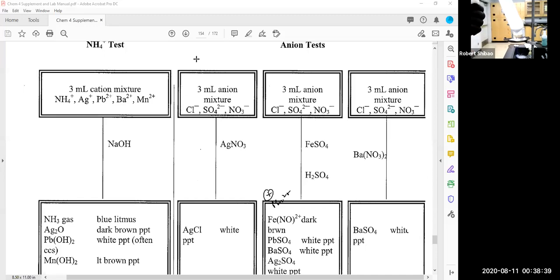What's happening here is you can see the precipitate's coagulating on the bottom. It's coagulating, so it's growing into bigger crystals, and those crystals are sinking to the bottom. I don't want to stir this because I want it to settle to make sure I precipitated out all the silver. Remember, if silver sneaks through, then that leads to interference. And so I'm going to just let this heat longer to coagulate more.